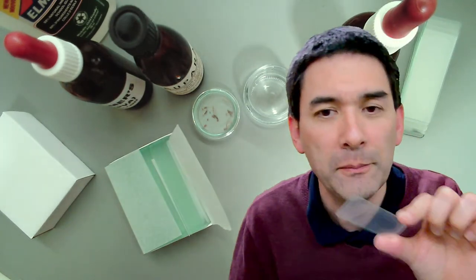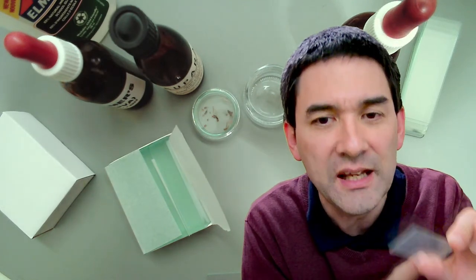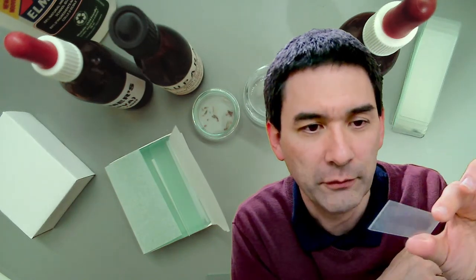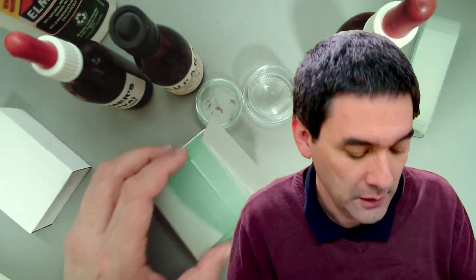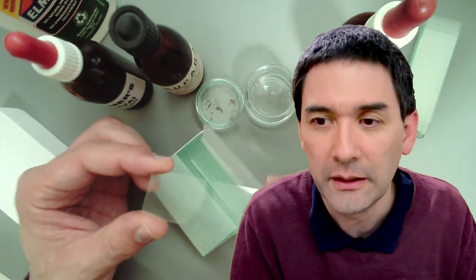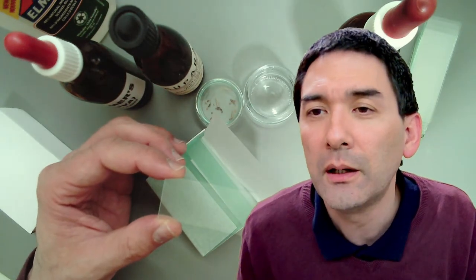And I actually had problems cleaning those with water. I could not clean them. I had to actually use vinegar or weak acid to remove this, because I think that these are water stains that are on here, and they're so bad, they're totally useless out of the box. Okay, so I bought several of them. They were pretty cheap, and then I actually, it says pre-cleaned, but they were not. So I got now those here, and they are clean. Okay, they are really clean.